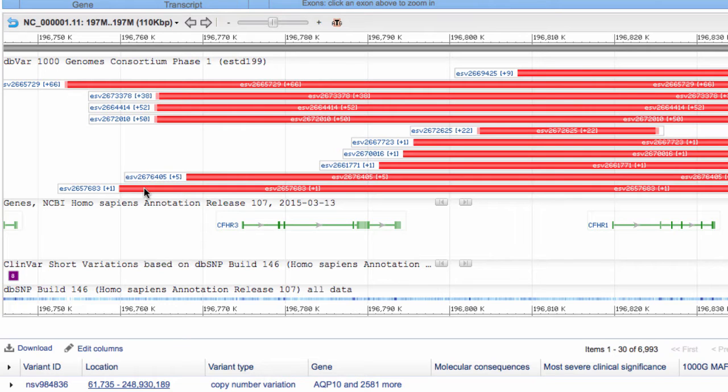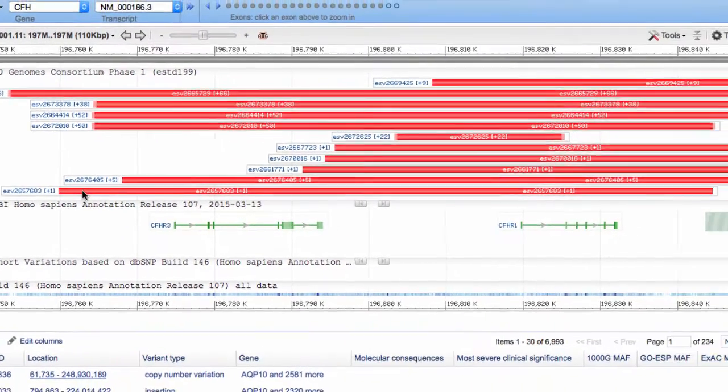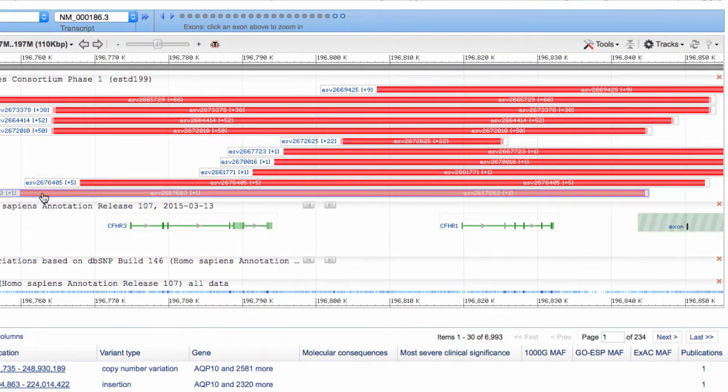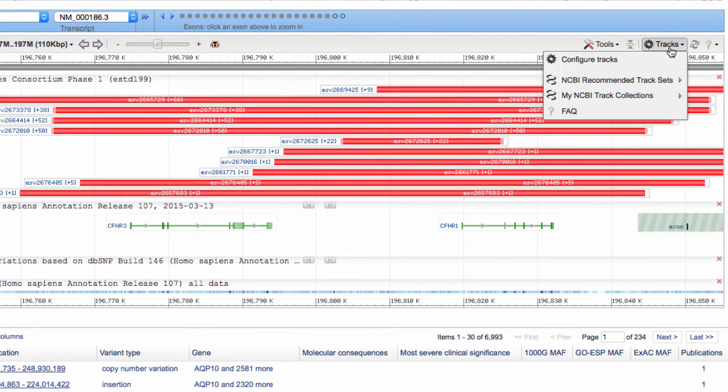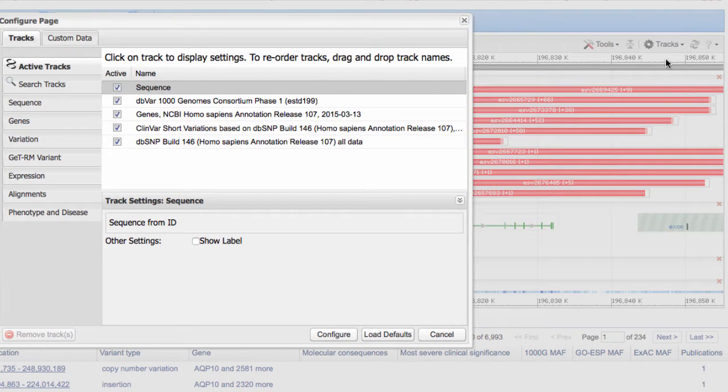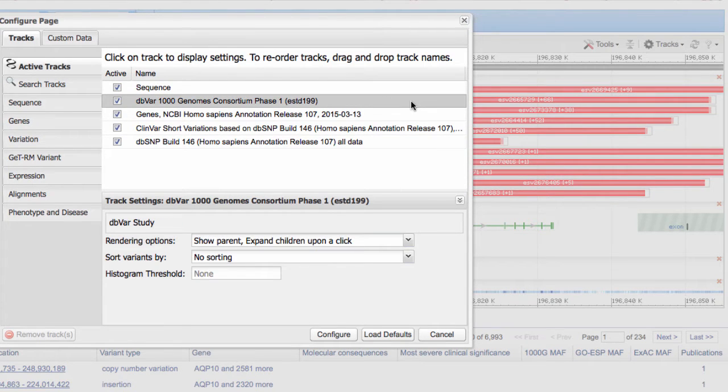Be aware that you may need to configure your tracks to see these numbers, so I'll show you how to do that. Go to the tracks menu, and be sure that the tracks you want are checked. Select one of the tracks.